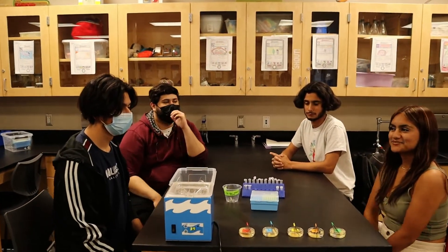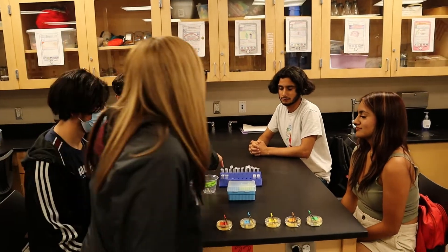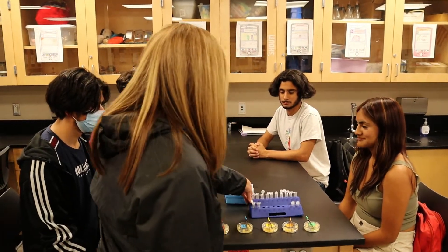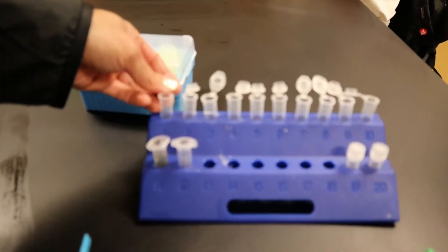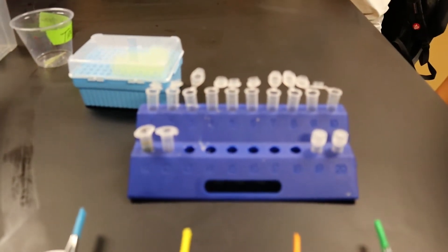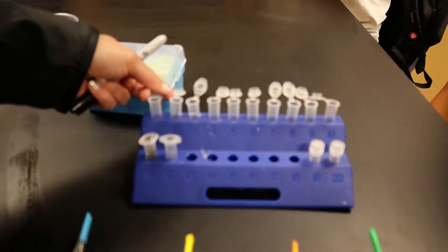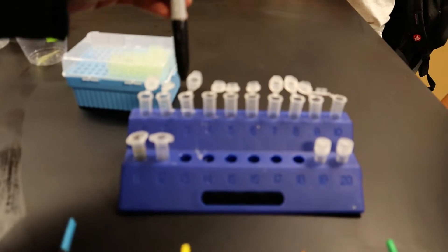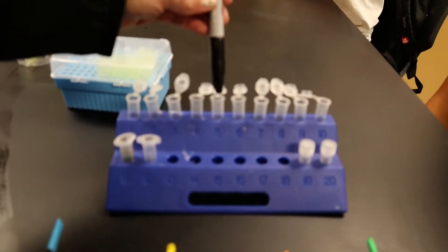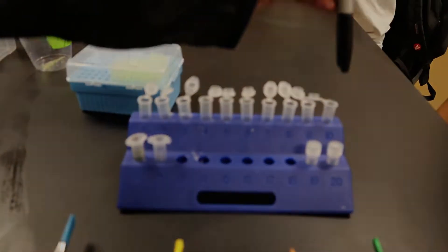So we're gonna start by labeling the snap cap tubes here. You'll see I have ten in a row here of the snap cap tubes. You're gonna use the Sharpie that's in your student kit to label both the top of the tube and the side. And we're gonna label it one, two, three, four, five, and then repeat one, two, three, four, five.